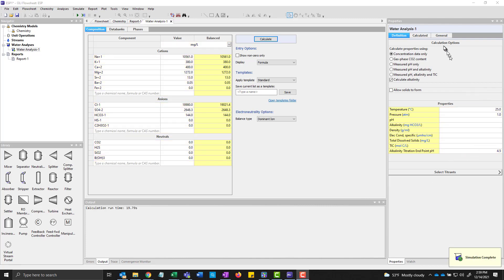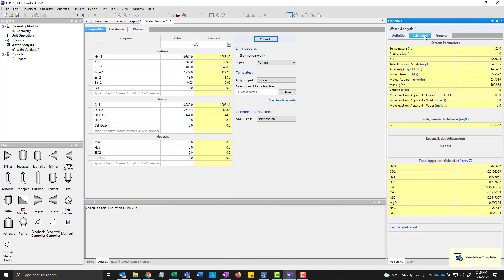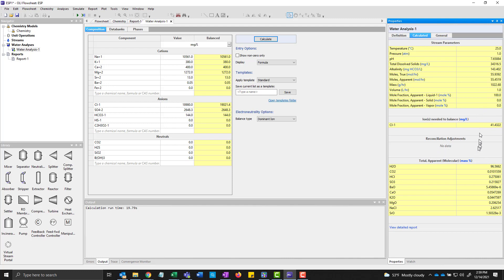And we can see what the calculated stream looks like by hitting the calculated button. And this tells us a lot about what happened internally. So it did tell us that we had to add chloride ion to make the sample electrically neutral. We're actually done with the reconciliation for this particular case.